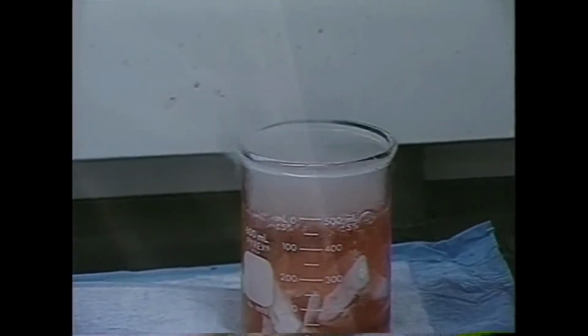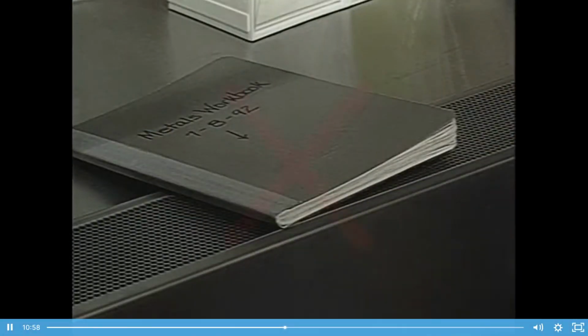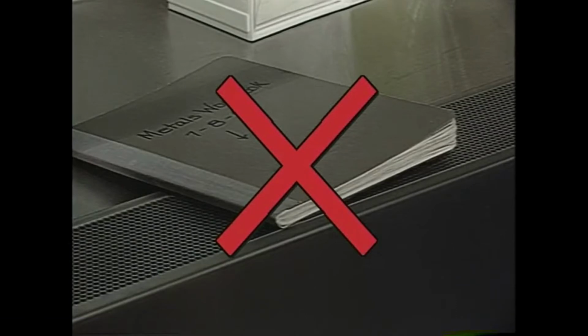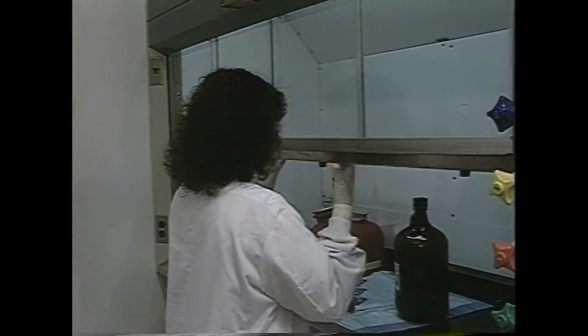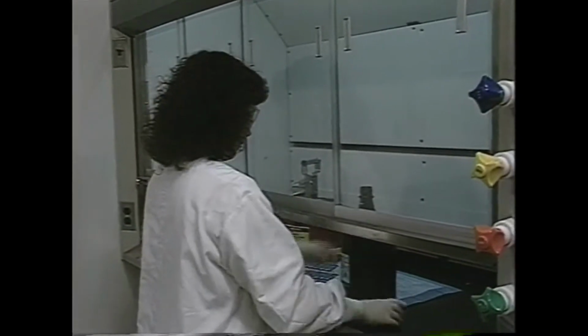As you know, a lab hood is a ventilated enclosure that helps contain fumes and vapors. But in order for it to do its job, we can't block the flow of air with equipment or materials. A lab hood can also act as a physical barrier against spills, splashes, and explosions, but only if we do our part by lowering the sash when we work.